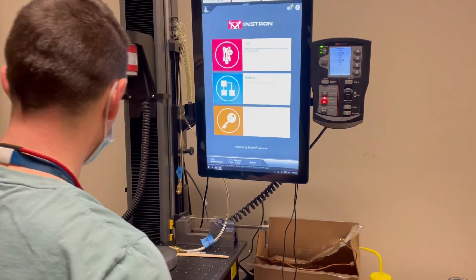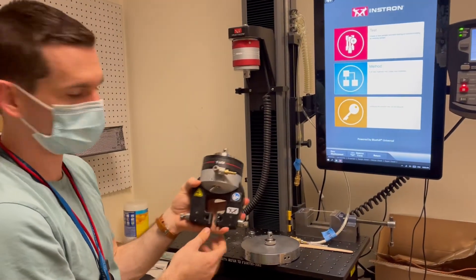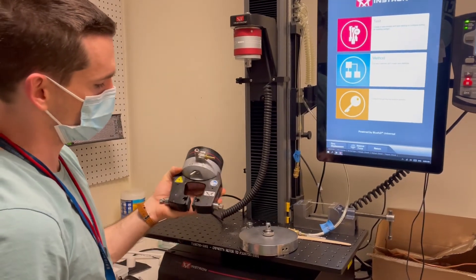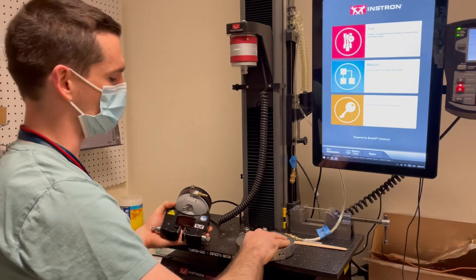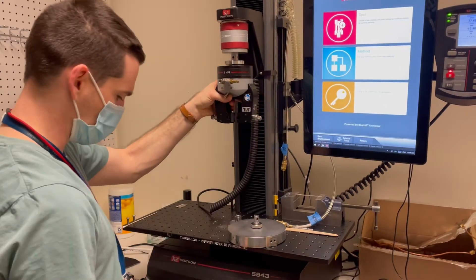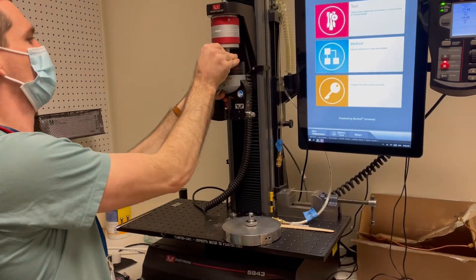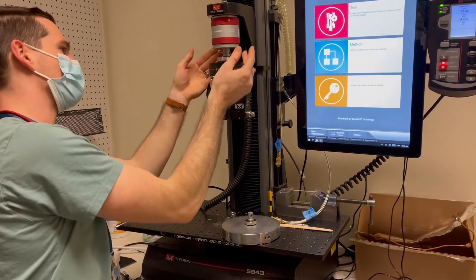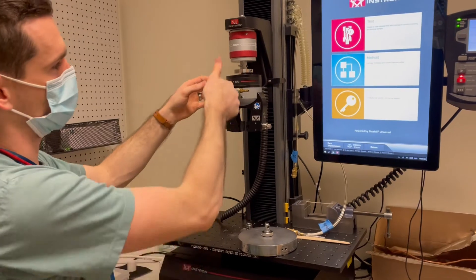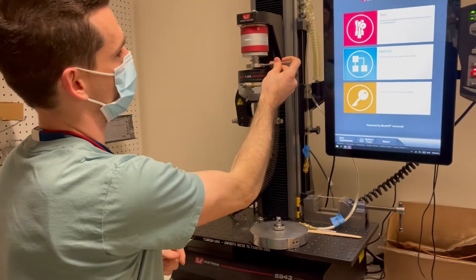That's all I would pretty much use on this. To install the grips, you have the choice of tensile testing with two of these pneumatic grips, which you can open and close with the switch. We also have compression platens — it basically goes through this hole here. You have these clevis pins and you put them through the hole, try to get it in the middle, then tighten the nut up to the top. On this side, you'll tighten it to the bottom. You also have these little pins which you can put in there and tighten it a little bit more.